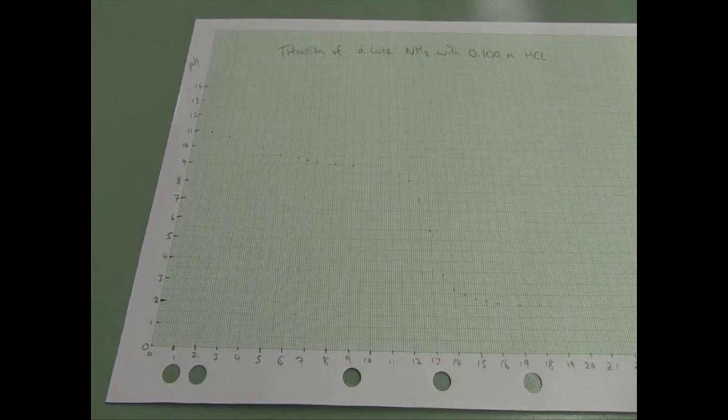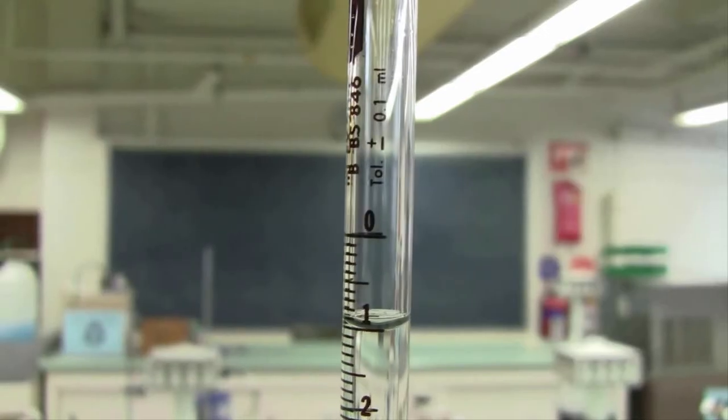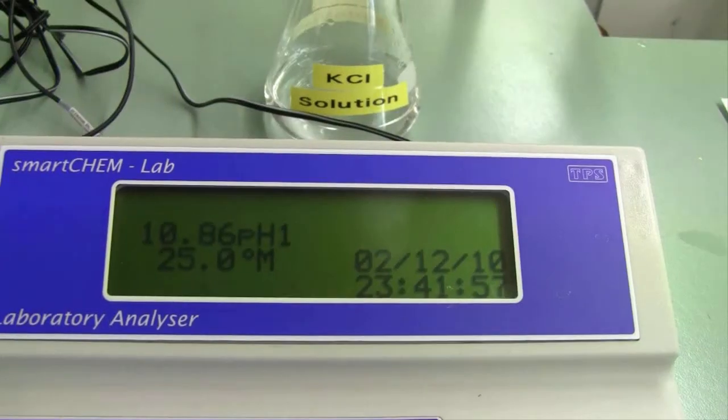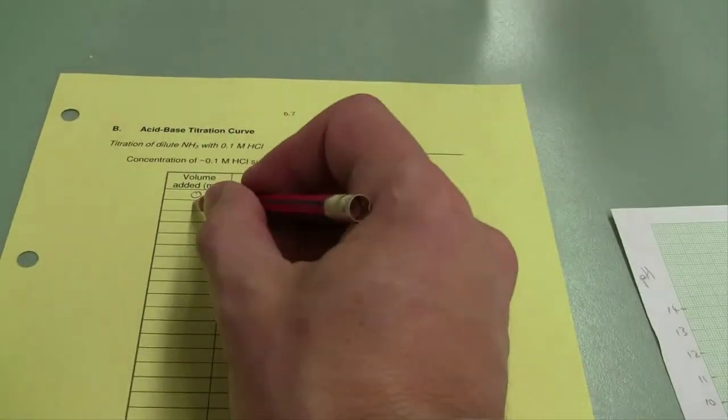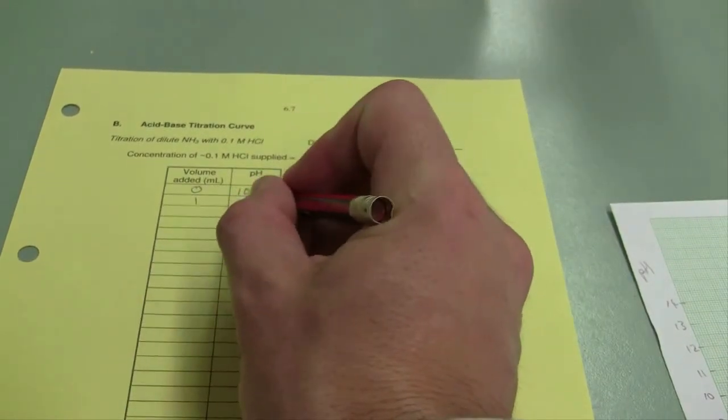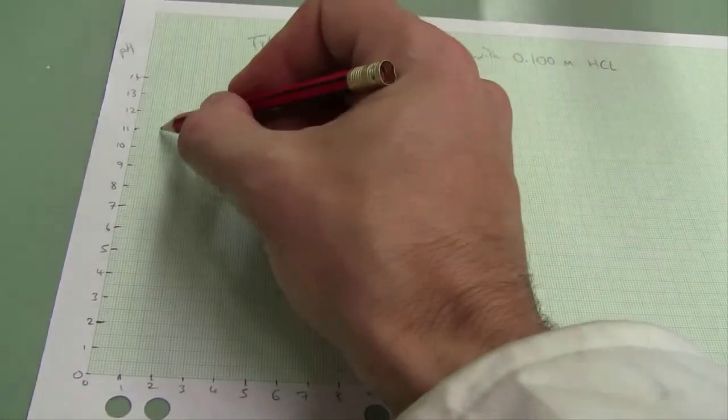What I would like you to do right throughout the experiment is make an addition from your burette. One ml additions in the first instance. Take a reading from your pH meter, write down the result in your result sheet, and then plot it on your graph. Repeat this procedure throughout the experiment.